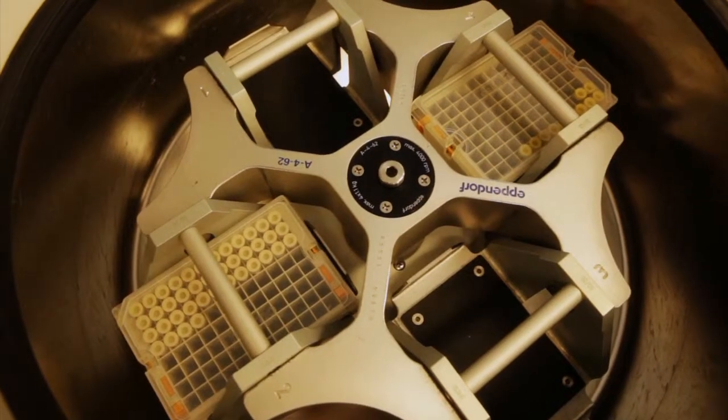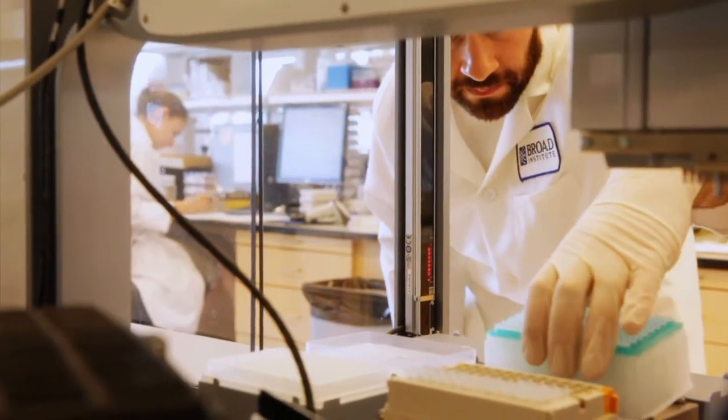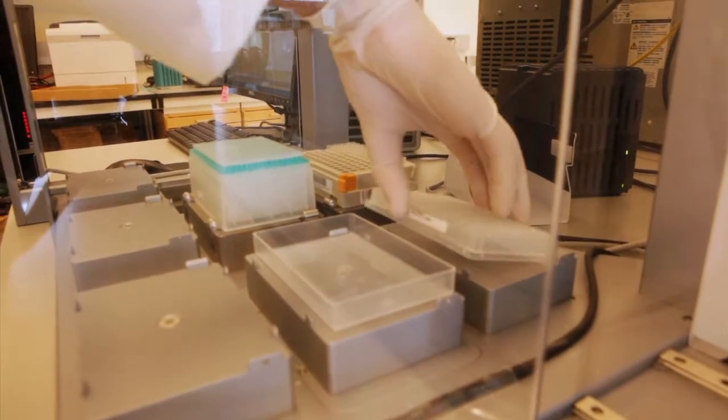These steps, quantification and normalization, allow Mark to see how much DNA is in each sample and help him determine how much to dilute each one.